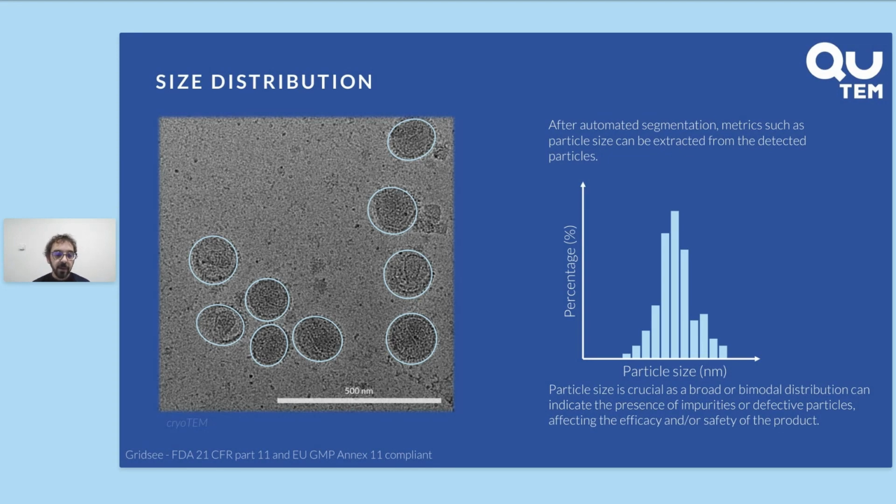Also here, TEM is quite powerful thanks to the direct visualization of your particles, in that if you would use other methods like DLS, for example, you would have several peaks, but then it would be hard to attribute peaks to actual populations or to actually characterize each peak. While here, again, you can directly relate the peak to the image.